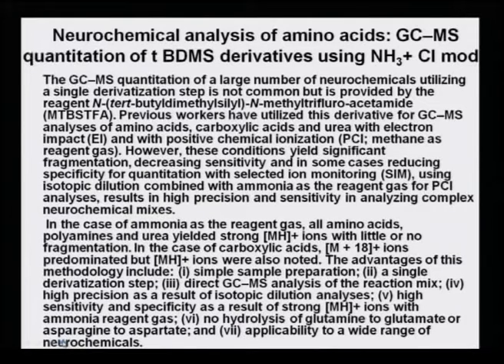The advantages of this derivatization method include that it is a simple sample preparation method, a single derivatization step is required, and thirdly, direct GCMS analysis of the reaction mixture can be carried out.